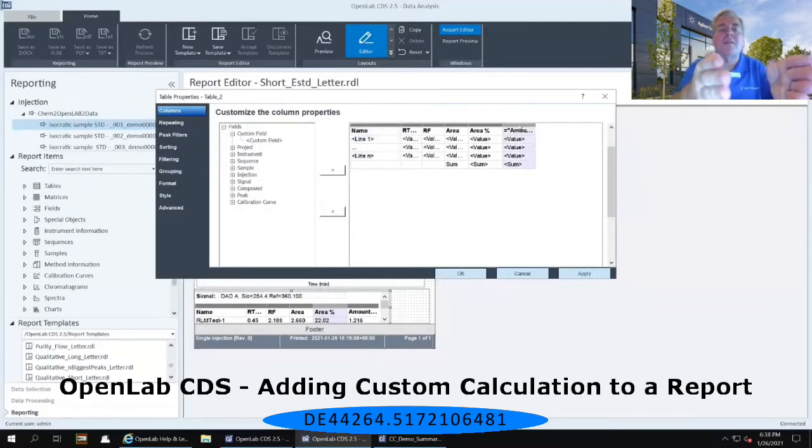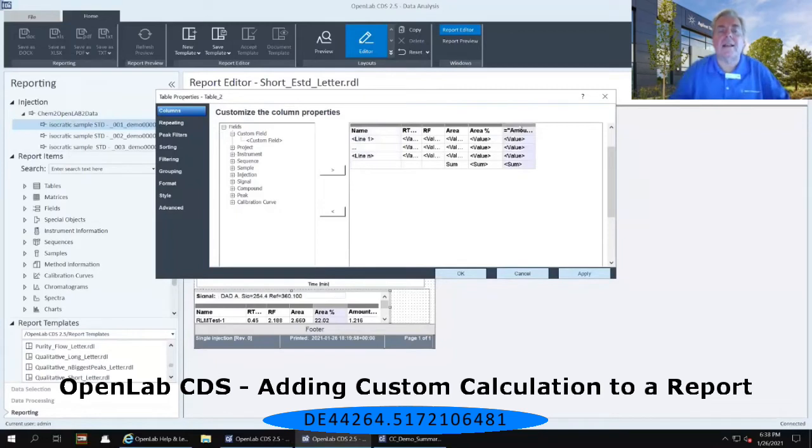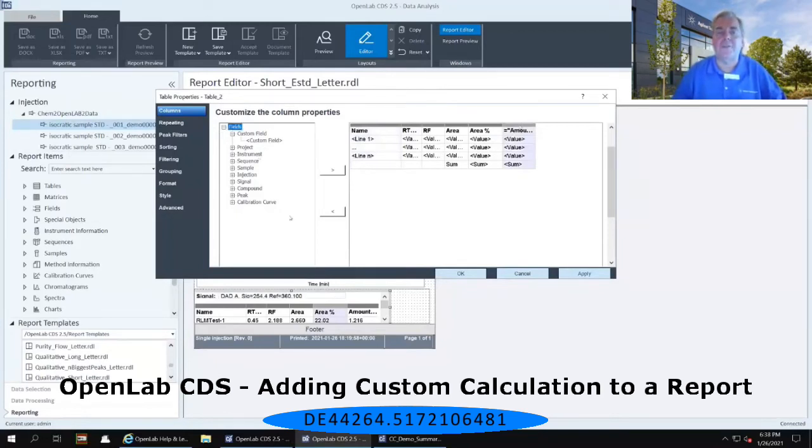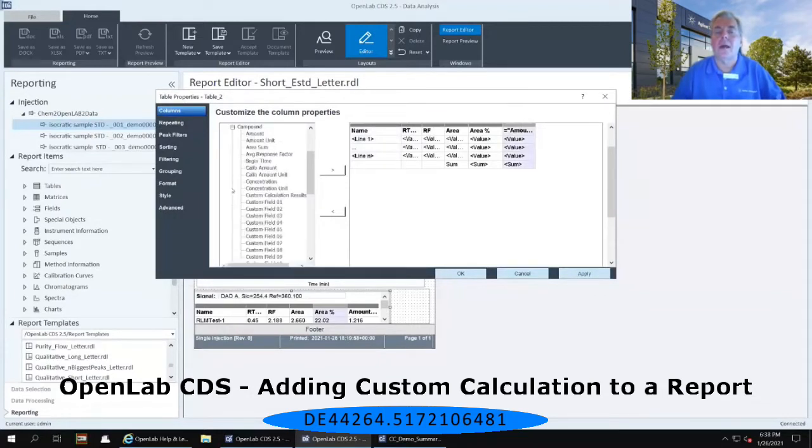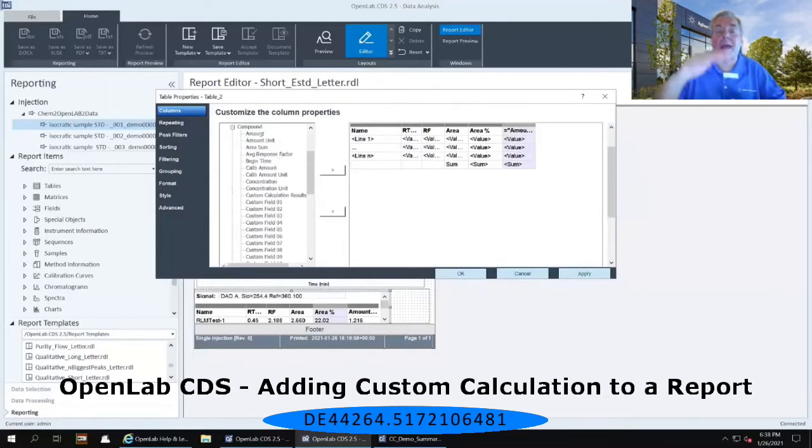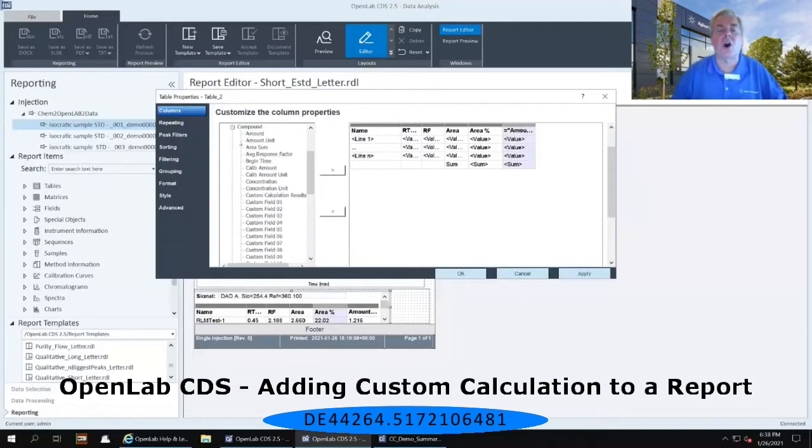Then for the fields that are just to the left of that, there are a variety of different fields that are available to populate into this table. So I'm going to go to the plus to the left of compound, and notice that as soon as I expand what's underneath that compound section, there is a place there called custom calculation results.